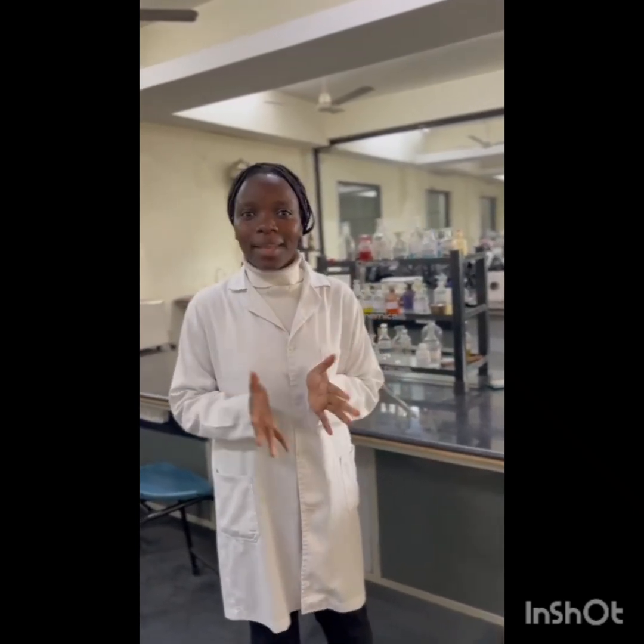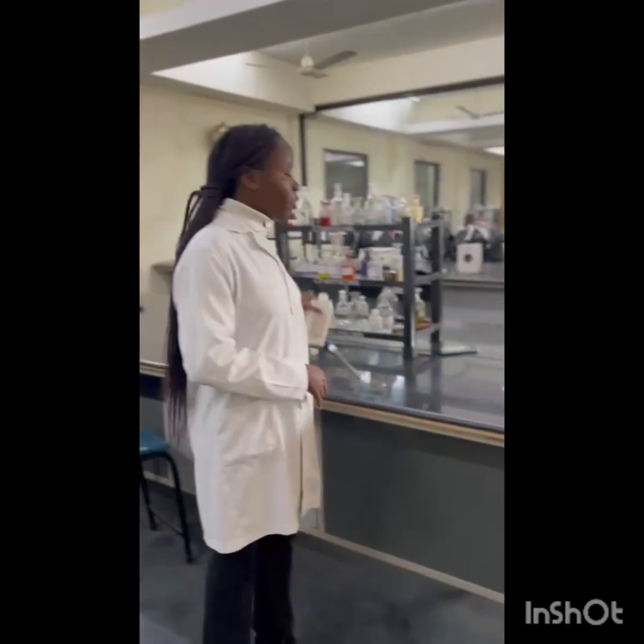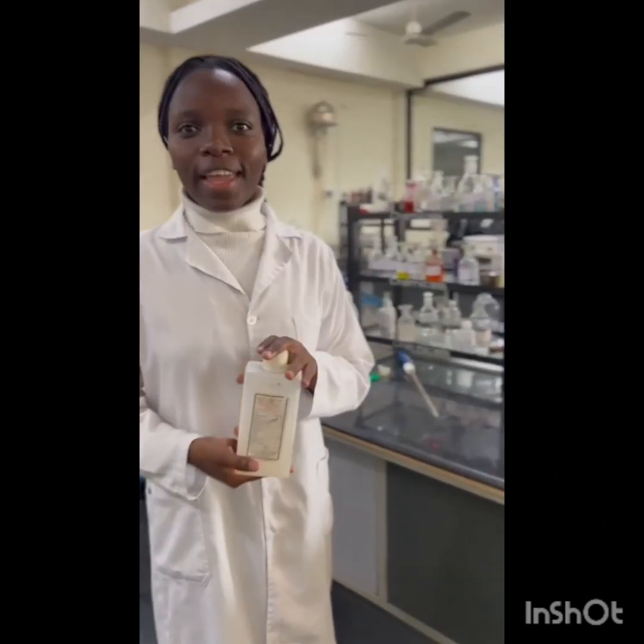But the problem is that it takes 6 to 8 weeks. How can you wait 6 to 8 weeks when you give a patient maybe 72 hours to come back and get their results? So according to what you're going to investigate and how much time you have for processing, you choose accordingly. For me today, I chose formic acid as my decalcifying agent.